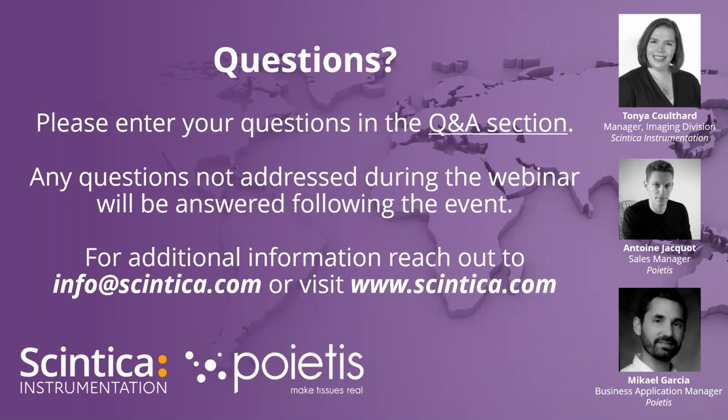Yeah, I'm just trying to figure this question out. So is there a way to automatically make this selection? I guess that person is referring to the different wells that we selected to distribute cell droplets. Yes. There are two ways to do this. From Mikhail's demonstration, you've seen that you can actually automatize that with the CAD software. So for example, you could have a grid bioprinted with extrusion, and then have a pattern of cell droplets inside every single well. That's a way to do so.